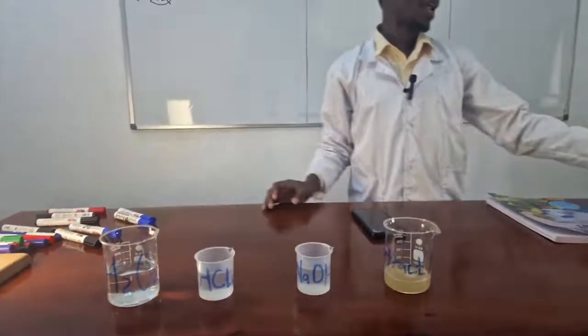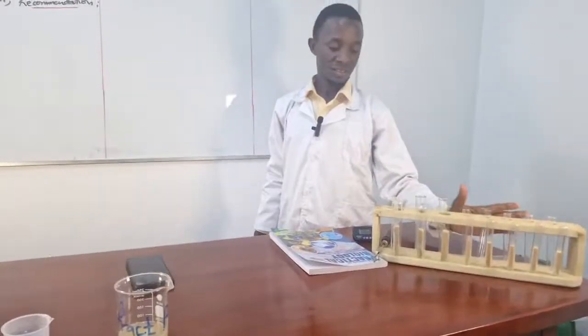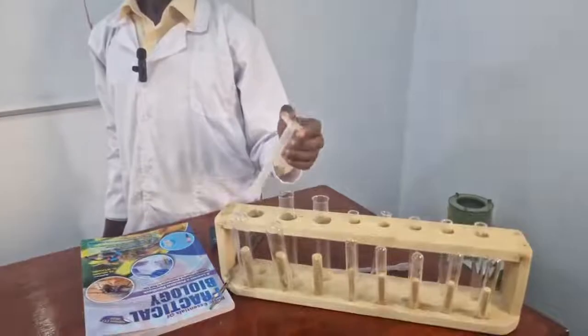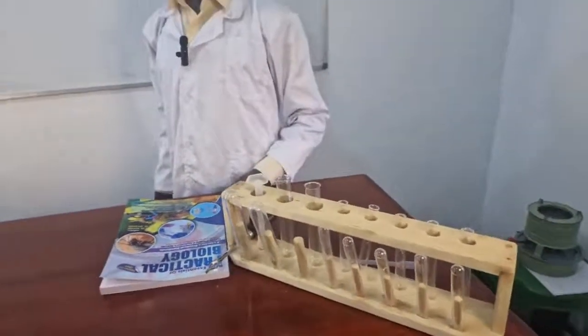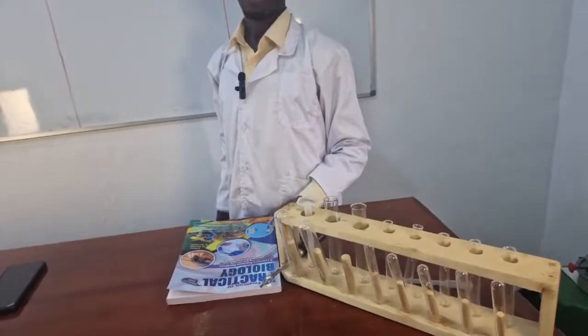And other apparatus, like the test tubes we have here, boiling tubes, and the measuring cylinder that we may need to measure the volumes if needed. You may need to measure time, you never know. So all these are availed.